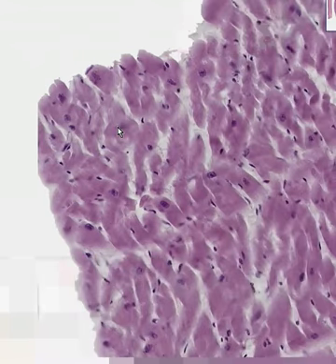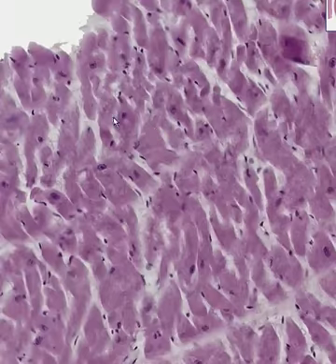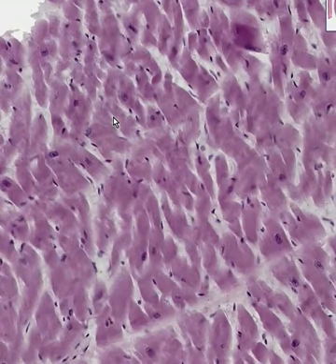Let's keep on moving away now from these nice smooth muscle fibers and go on to our third type of muscle, which we are going to be seeing very soon, I hope. And sure, we have just landed on the coast here, and we can start to see some muscle fibers now in which I think you will admit it's a little bit more difficult to see the striations. Perhaps I could convince you very soon that, let's go to a different area. Maybe we'll see some striations better.